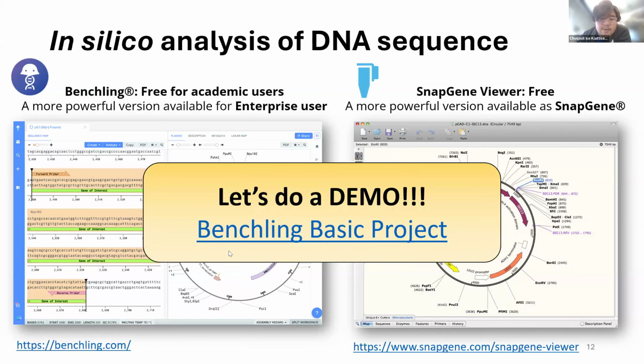All right. So what we're going to show you today is the Benchling project, and the slide that I'm sharing to the BioBootCamp website should already have this project on Benchling. So if you go to the slide and click onto this one, it should lead you to this kind of Benchling folder.